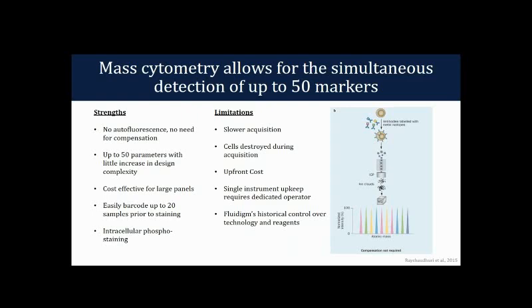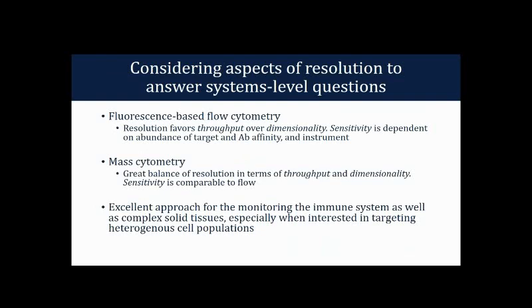We have additional mass cytometers that are coming to the market from Beckman Coulter, I believe, and other companies. So I think we're starting to see a shift there.